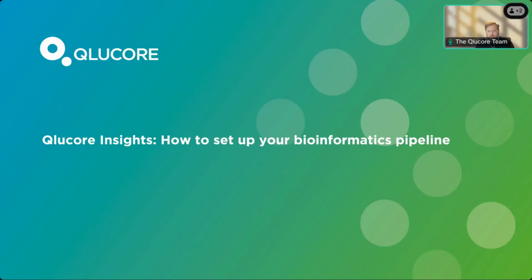My name is Fredrik Hellborg, and I'm Director of Diagnostic Sales here at Qlucore. The title of today's webinar is Qlucore Insights: How to Set Up Your Bioinformatics Pipeline. To explain all that, I have my colleague Caroline with me today. She will let you know exactly how to do that. We will come to the questions when appropriate.